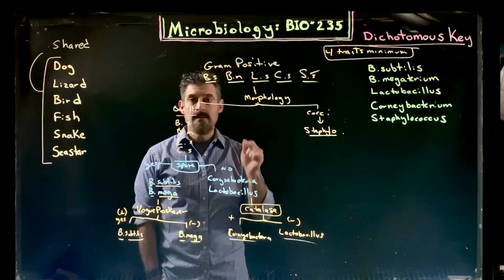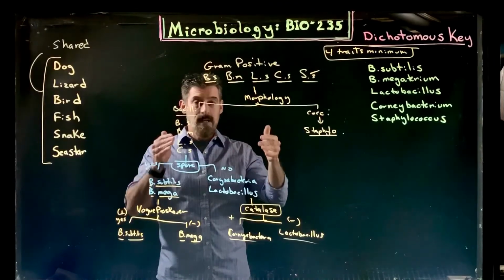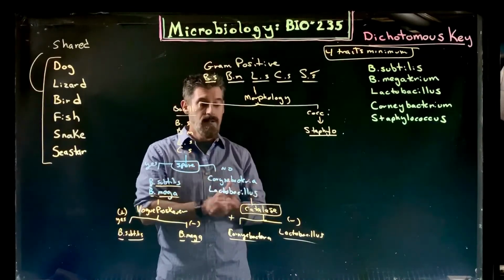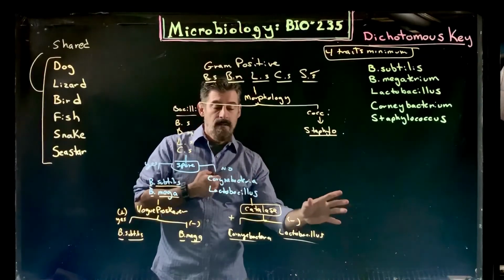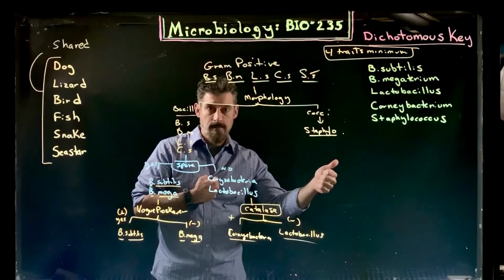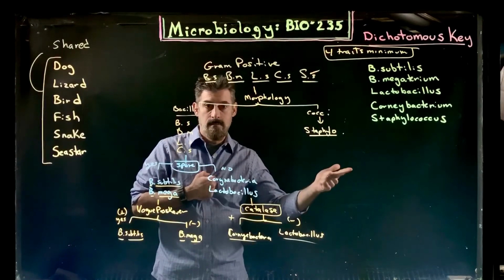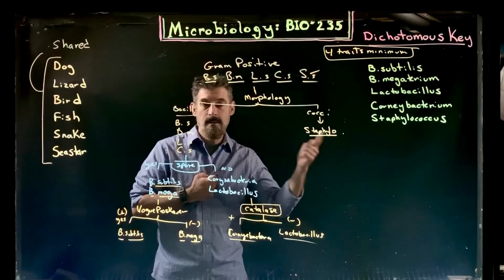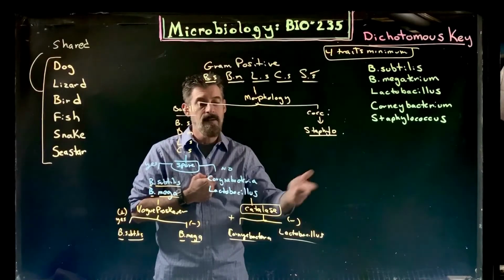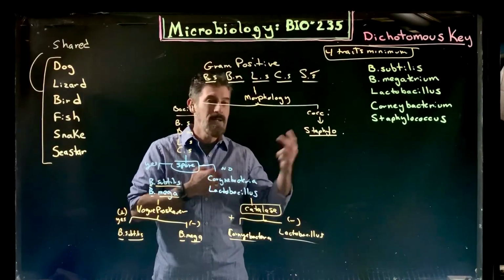The thing is, it's not just that this is the next assignment that's graded, is that you will have to use this yourself for the final assignment. And this is what you'll use to help determine your unknown. So if I said, this unknown bacteria is, the gram test showed it was purple. I said it did an endospore stain, and there were no endospores, or I said all cells were pink, no green structures were found. So you have to interpret this. I might say it's a catalase test, produced no bubbles, that sort of thing. So I'm giving you characteristics.